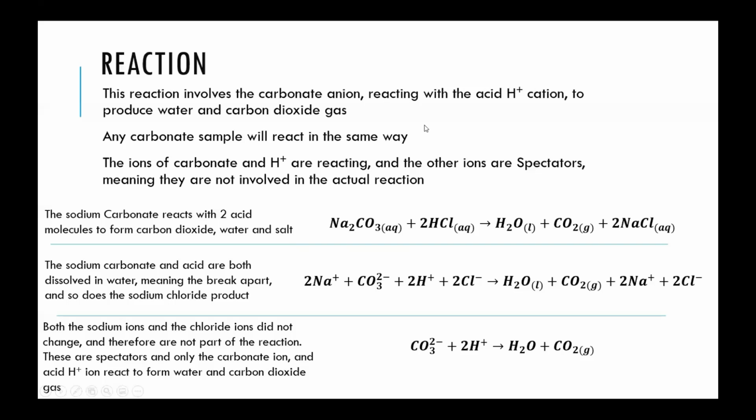And what is usually done is it undergoes a reaction, and through the reaction generates a product that you can measure. In this case, we're measuring the carbon dioxide and then using the chemistry of this reaction to figure out, based on the amount of carbon dioxide, how much carbonate was there to start.